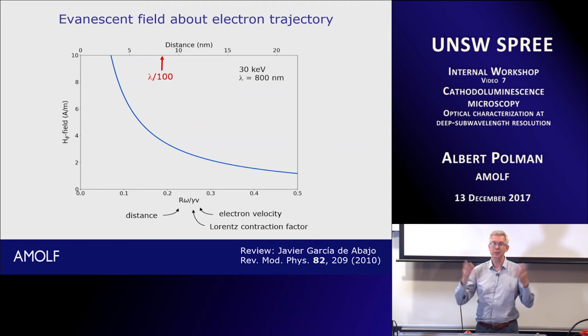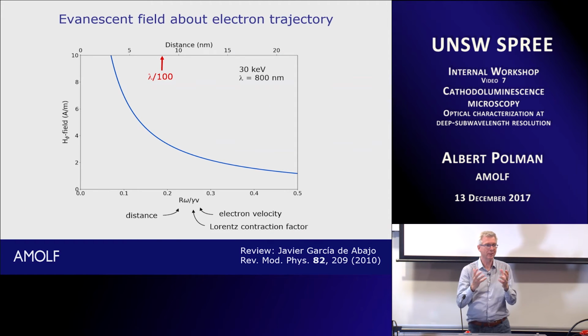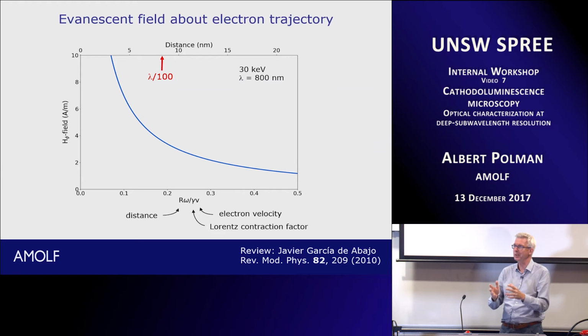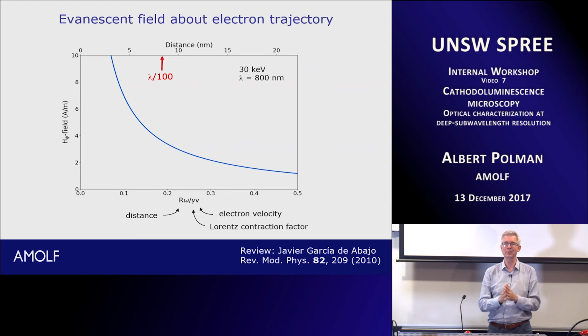So what's the resolution then? Okay, we say the spot size is a nanometer. So are we now saying we can do optical microscopy at 1 nanometer resolution? Well, now we have to be careful, because what did we mean by 1 nanometer?